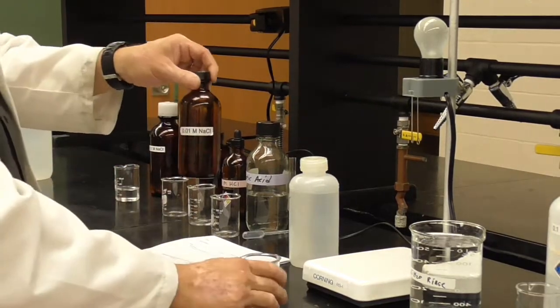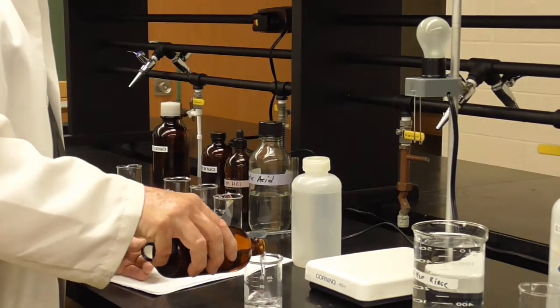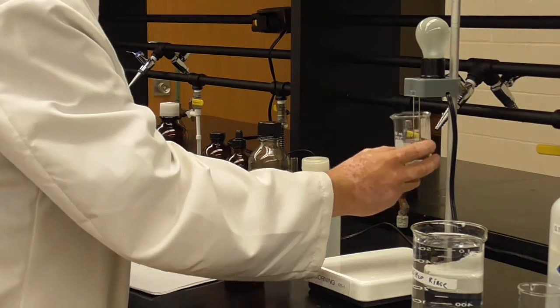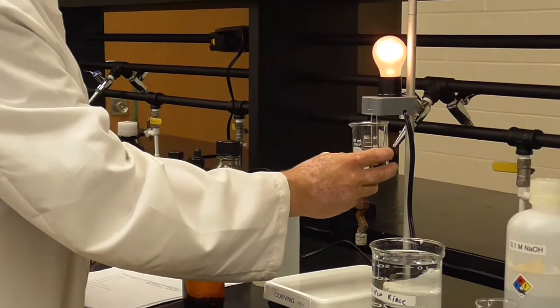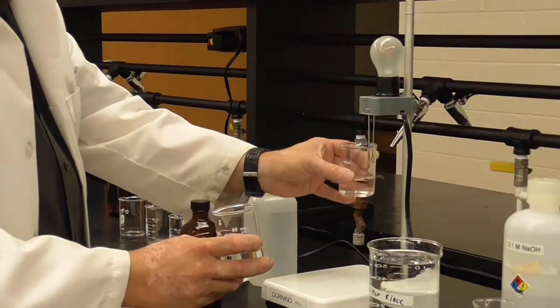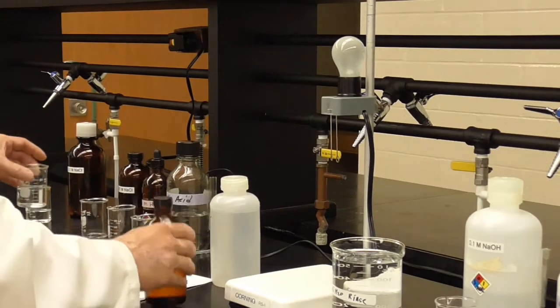Our next solution is 0.01 molar. So our first one was 0.1, this is 0.01, so there is 10 times less sodium chloride in this solution. All right, here we go. It goes on, but I can tell, maybe you can tell anyway, it's not quite as bright. Here's the 0.1, just try to show that again. Here's the 0.1. Here's the 0.01. So you can see it is working as an electrolyte, but not as strongly.